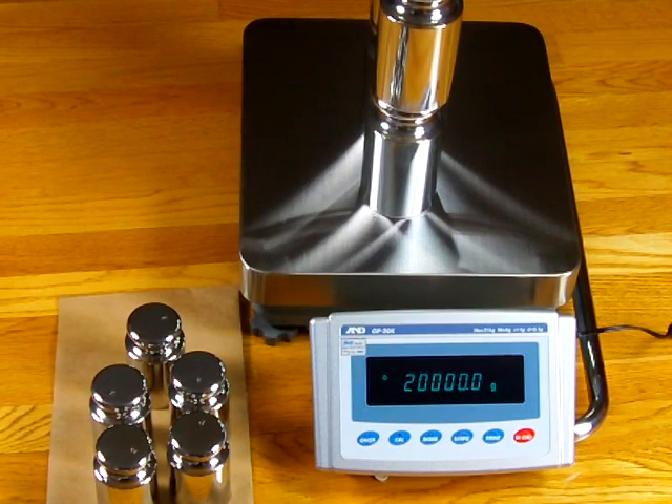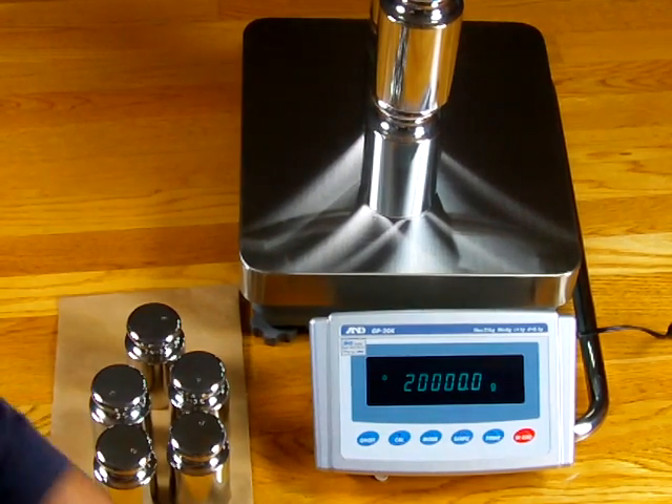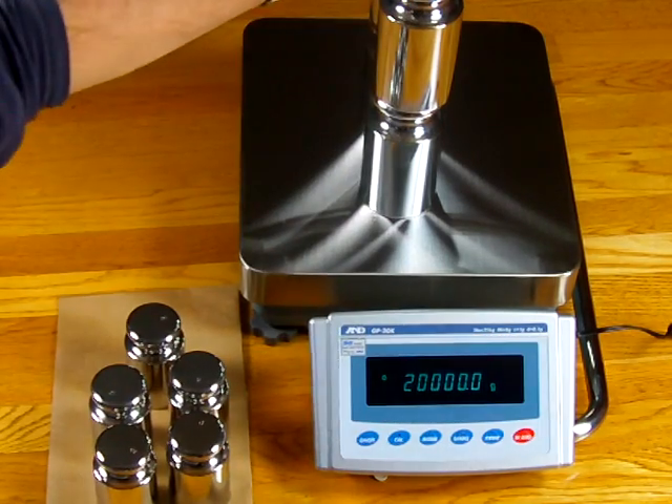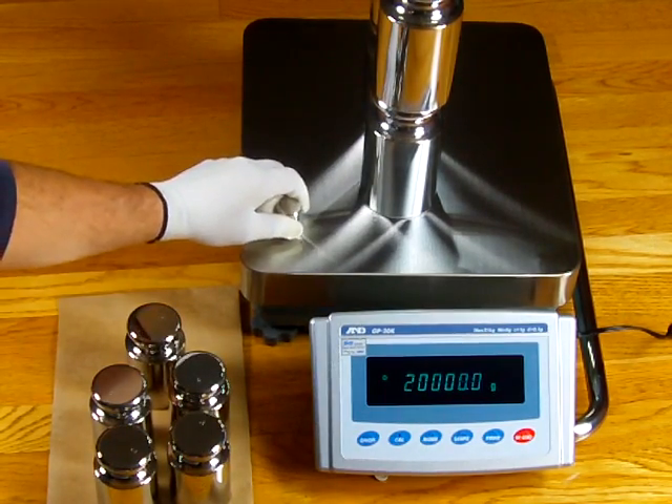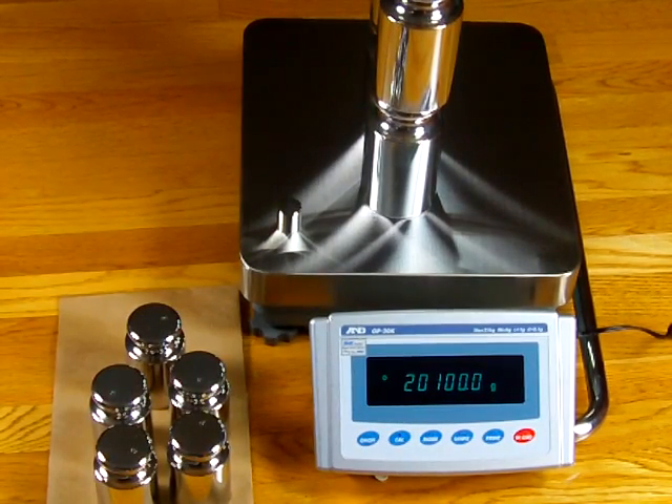So there you have it. This is our video on the A&D GP20K demonstrating that you are much better off doing external calibration than internal calibration. If you have any questions, give us a call — we're an authorized A&D dealer. Precision Weighing Balances — visit us at balances.com or scaleman.com.